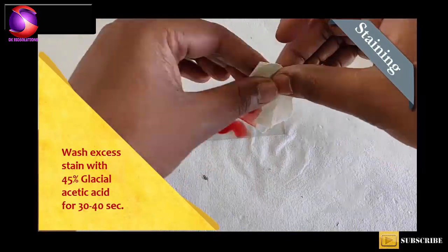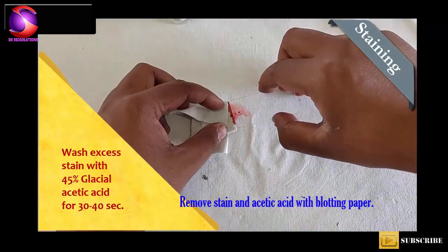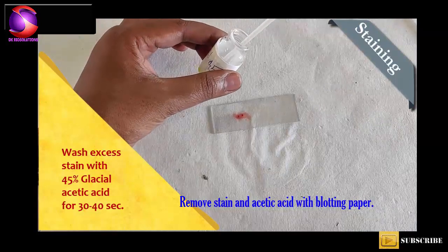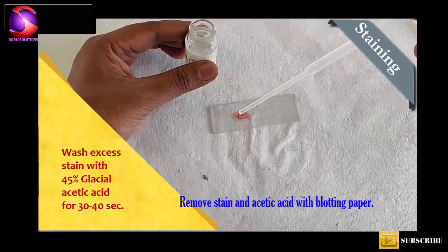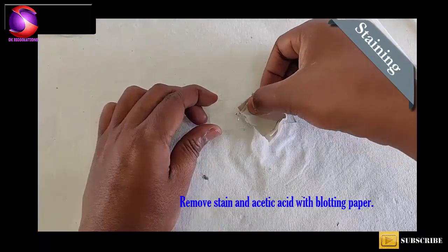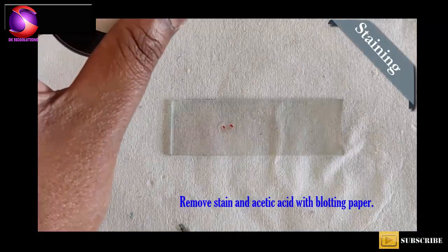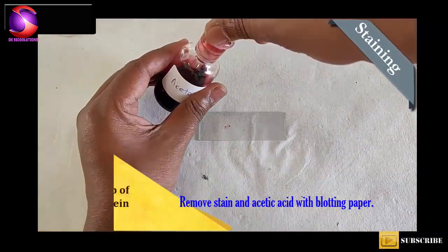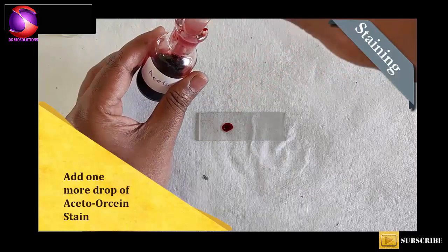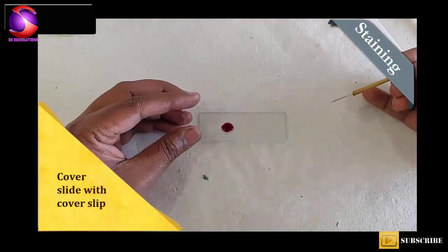After 45 seconds, take out excess Acetic Acid by tilting the slide and with the help of blotting paper. Now again add 1 drop of Aceto Orcein stain and cover the salivary gland with a cover slip.